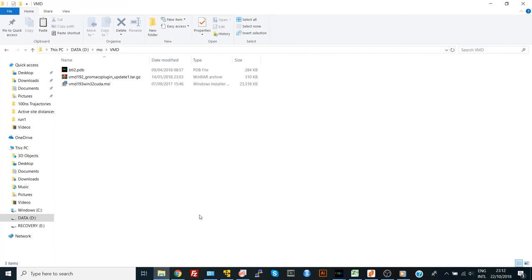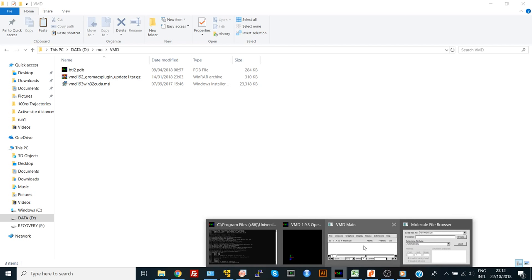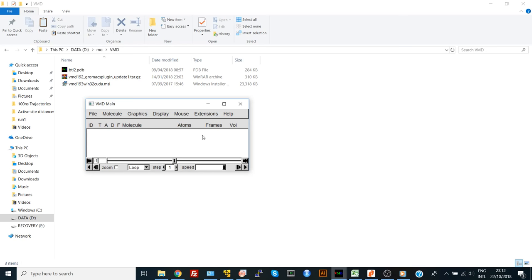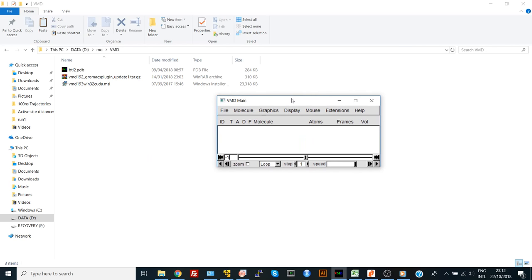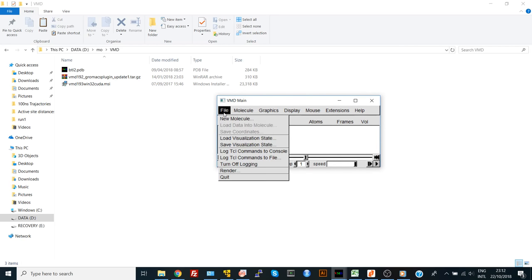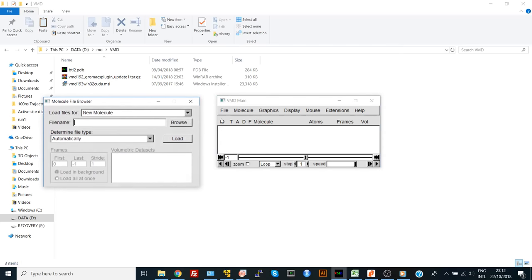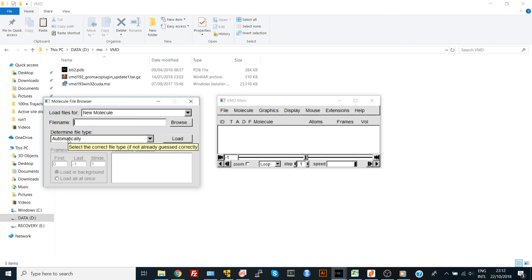To load the protein PDB structure into VMD, simply go to file and select new molecule. Here you can browse the file location and determine your file type.